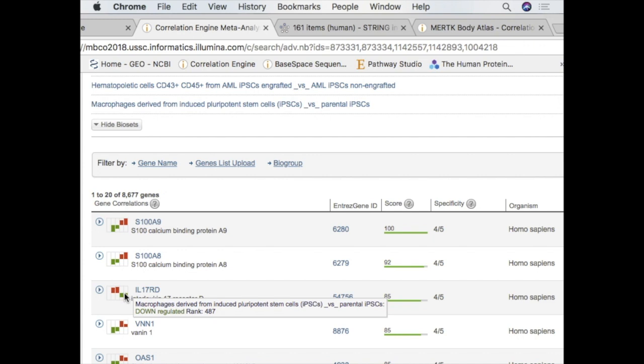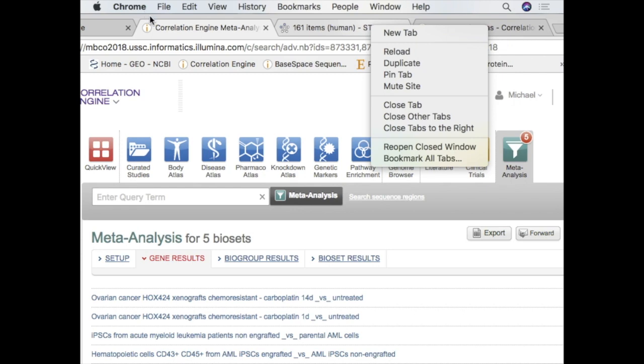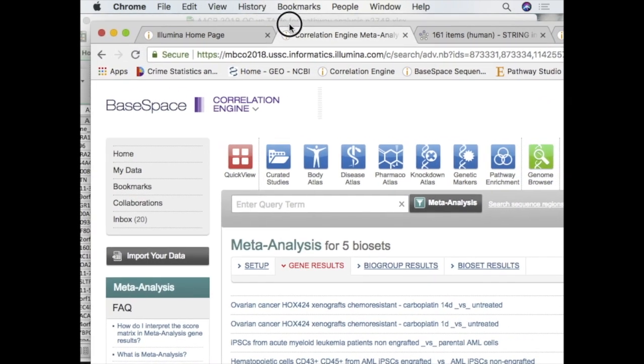It's just like Nate Silver, right? You take the average, everybody's kind of seeing the same thing, maybe not in the exact magnitude, but when you put all that information together, it's just incredibly powerful. Okay. Let's go to, so that is Correlation Engine.